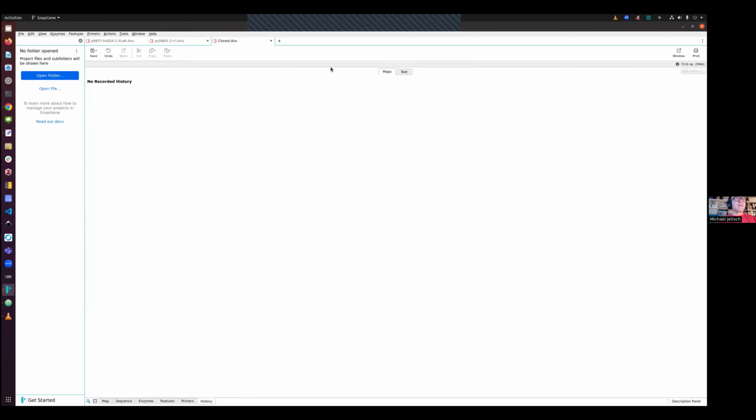All right, I guess that is all I wanted to tell you. But if you have any problems with the program, despite this short demonstration, please get in contact, because we can sort them out. Some of them are unfortunately non-trivial, especially when you have run into one of these bugs, which occur independently of you.